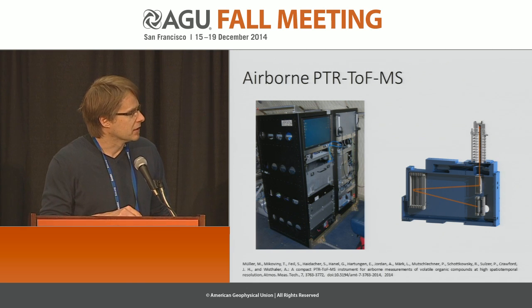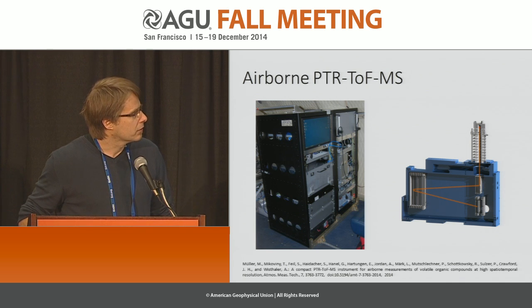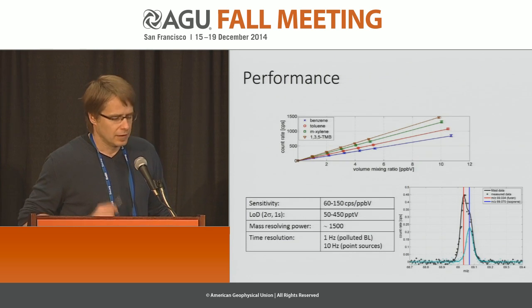And so the concept is basically, the source is the same. You have an H3O+ source, and here you bring in your air sample, which you protonate, and the organic compounds, you analyze them in the time of flight mass spectrometer.